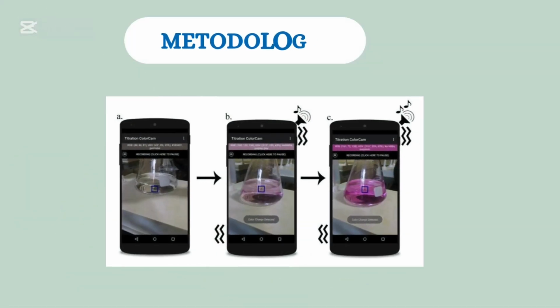If the color enters that range, multisensory signals are activated: a short beep if the color starts to change, a long beep and continuous vibration when the endpoint is confirmed.